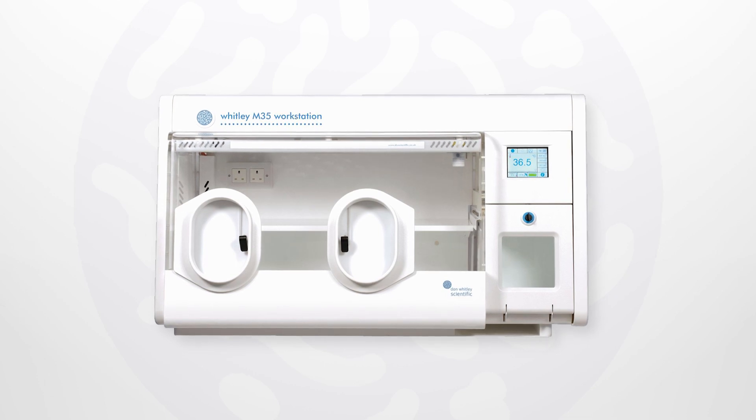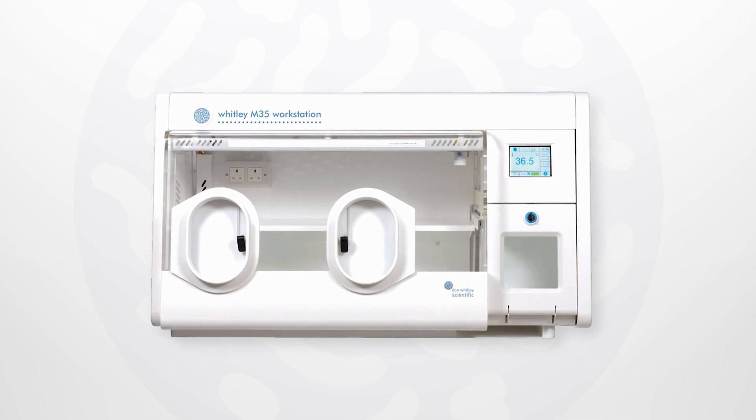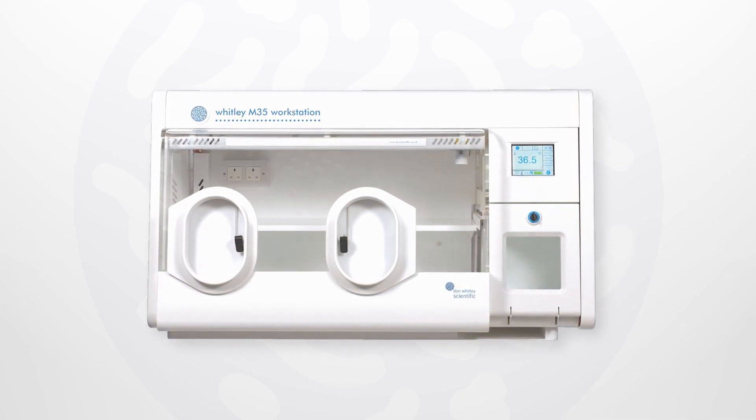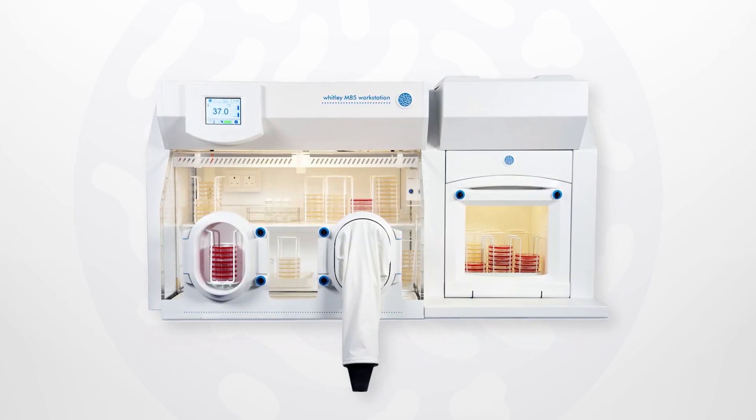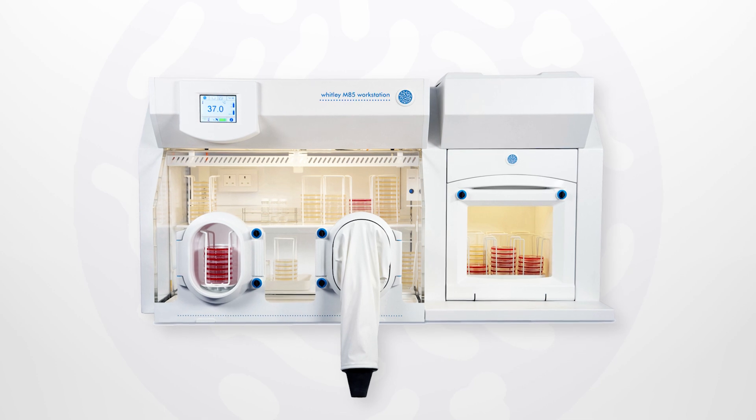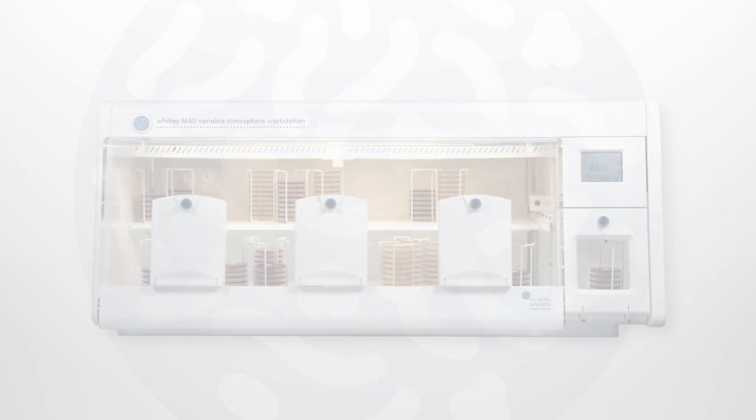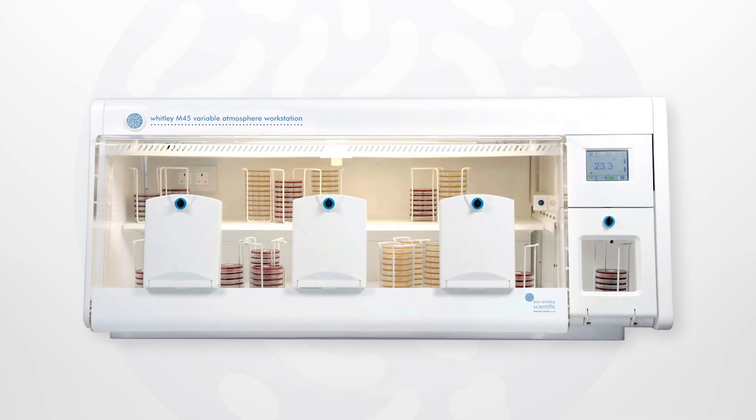The Whitley microaerobic workstation range comprises Don Whitley Scientific's most flexible modified atmosphere cabinets. M-range workstations allow anaerobic, microaerobic or hypoxic incubation atmospheres to be created without the need to change any of the connected gases.